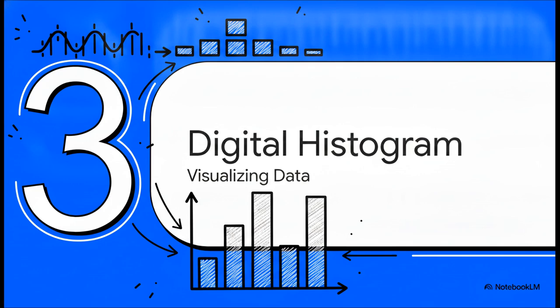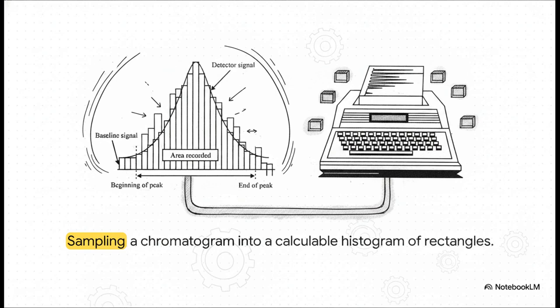Moving right along to section 3, building the digital histogram. So once the signal is chopped up, how does the software picture it? Think of the histogram metaphor. Instead of one smooth, sweeping Gaussian curve coming from the detector, the data gets sliced up into these blocky, calculable time intervals. The chromatogram gets stored in the memory simply as numbers that correspond to a series of discrete rectangles. It's basically a digital mosaic of the chemical reaction.